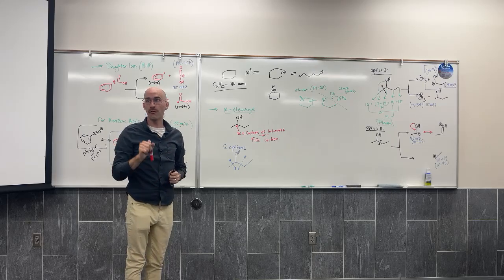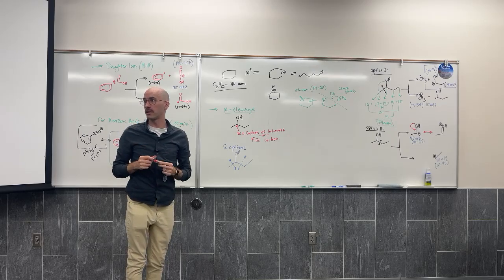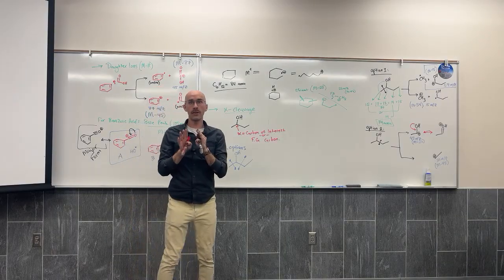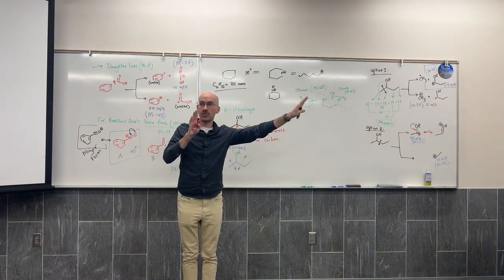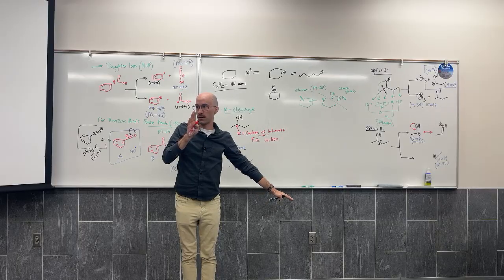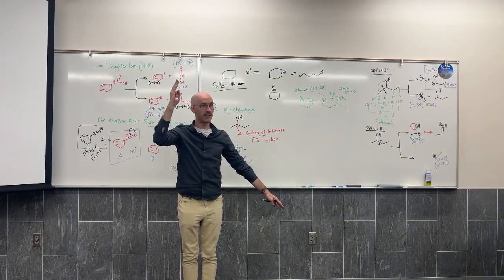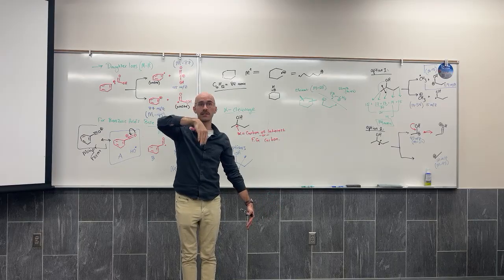This is why alpha cleavage is the most common type of daughter ion formation. When the group adjacent to the functional group gets cleaved, the functional group can often participate in resonance to stabilize the positive charge.